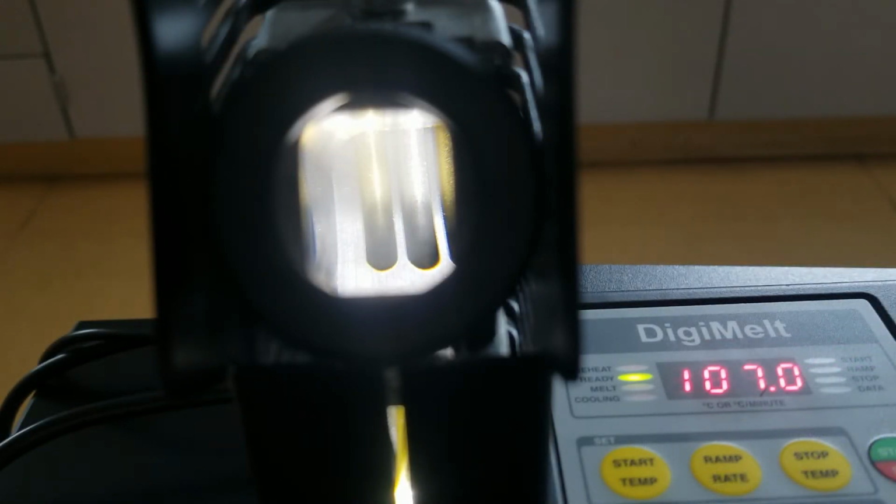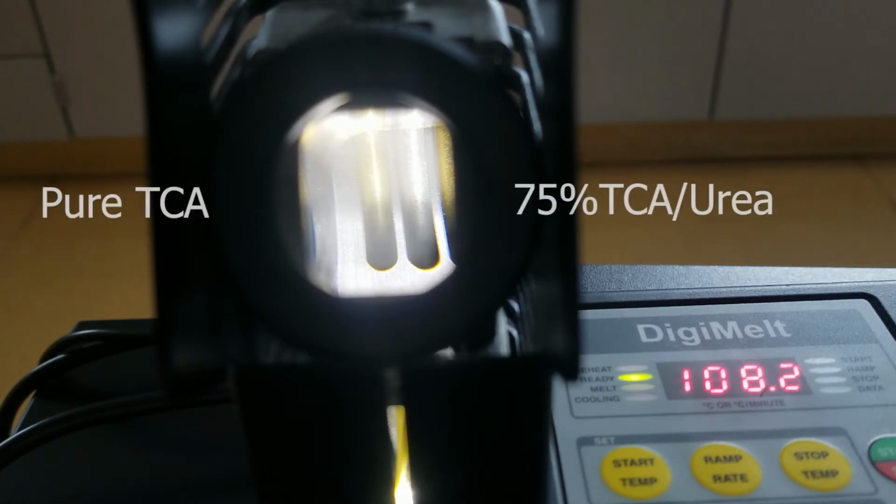All right, so for this one, we're going to go ahead and melt pure TCA and the 75% TCA. So pure TCA on the left, see it there? And then let's go ahead and put the 75% right next to it on the right.